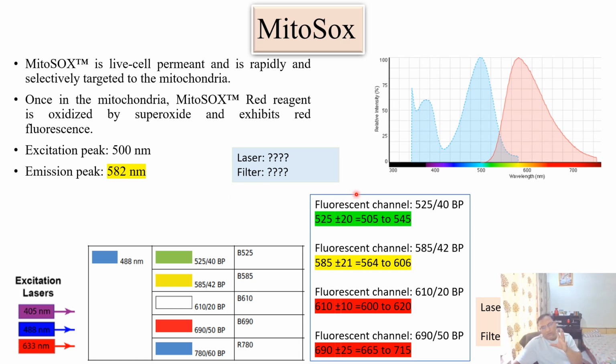When taking any fluorophore, we should know its excitation and emission wavelengths. In this example, the blue color is the excitation wavelength range.